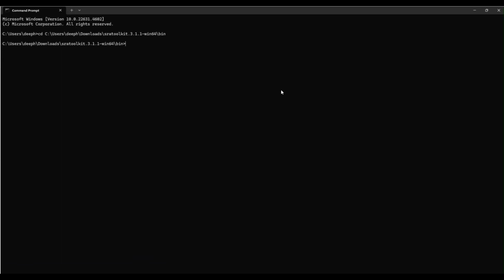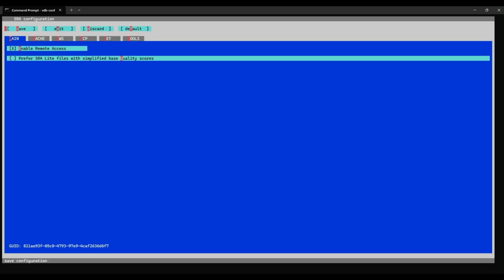I make it bigger. So here we can write this code: vdb-config and -i for the interactive environment.